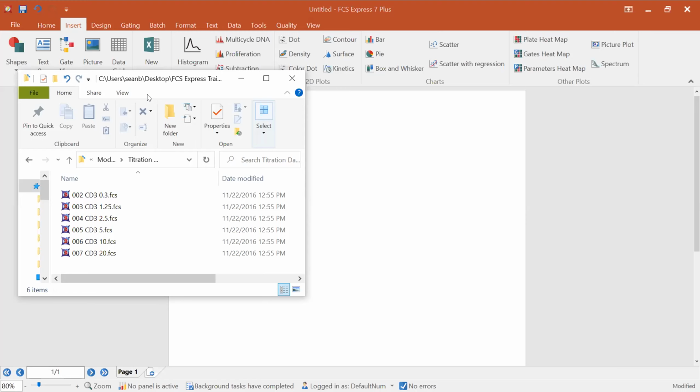And the first thing I want to do in FCS Express, yep.